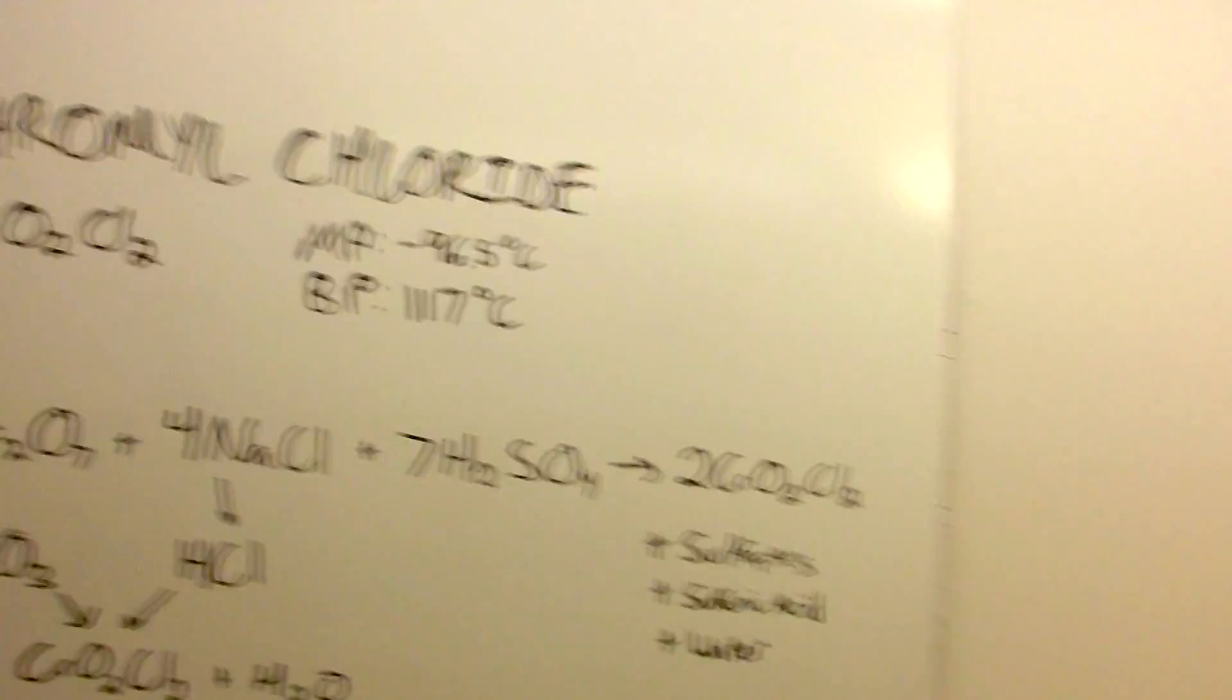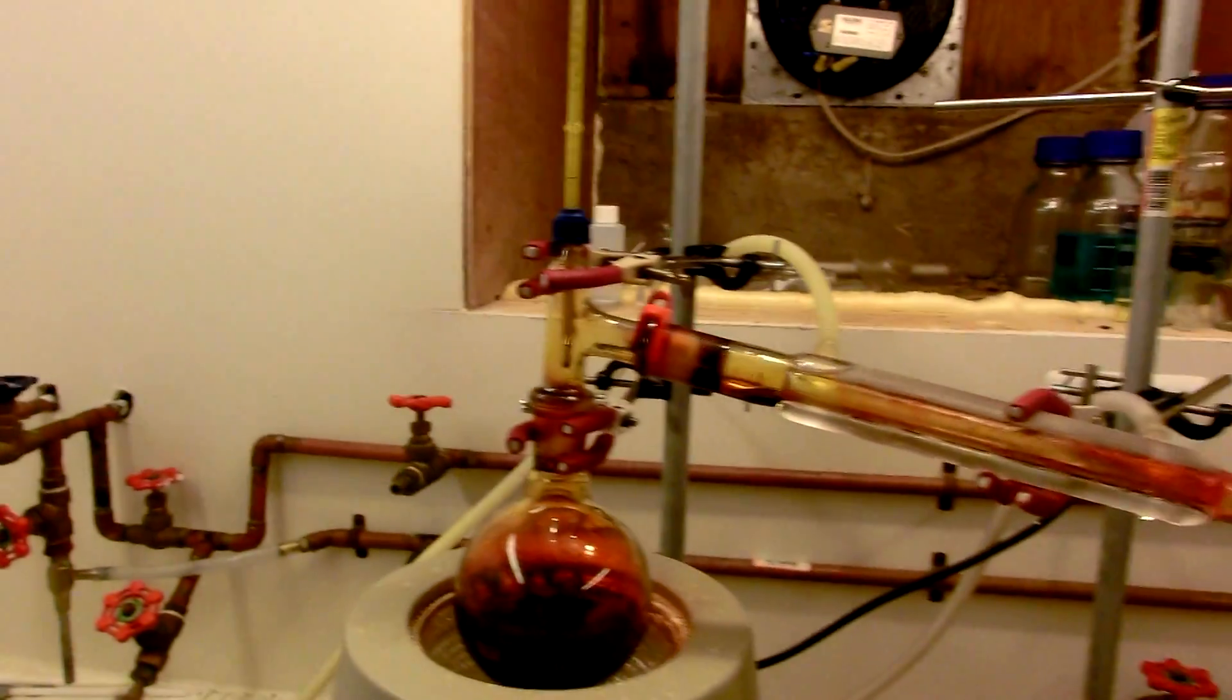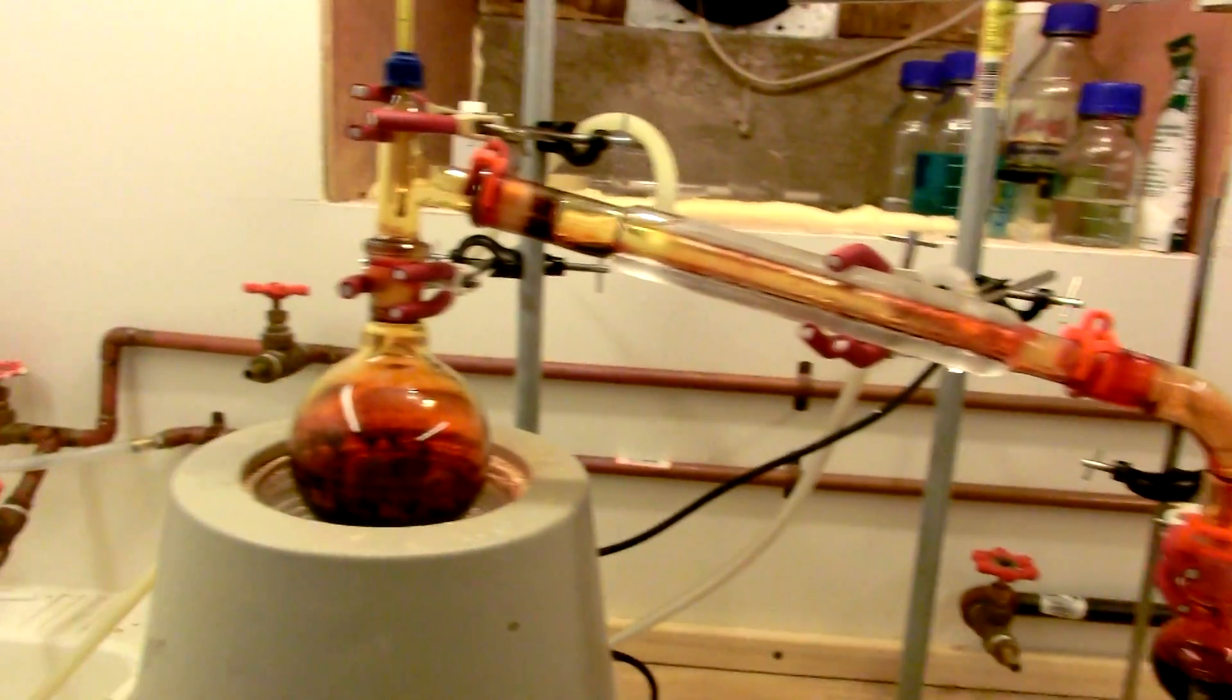All of the chromal chloride came over at about 112 Celsius, which pretty much corresponds to the 117 as predicted.